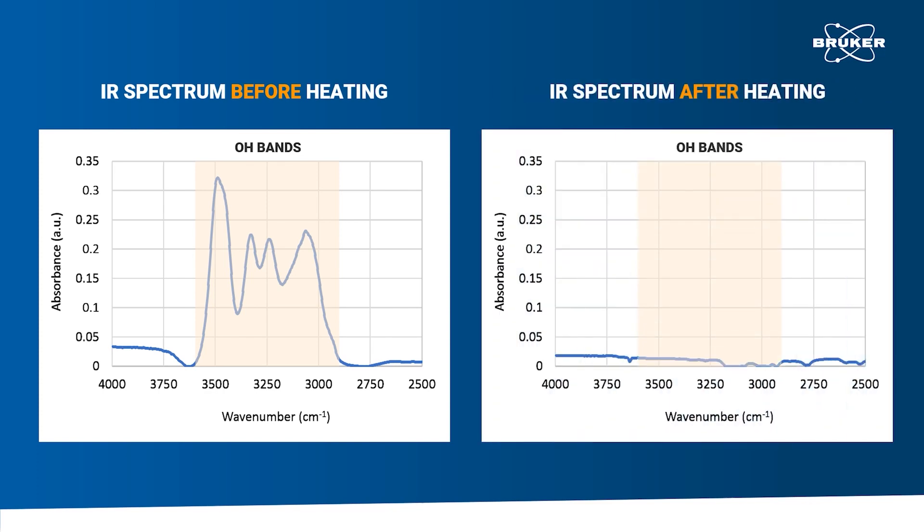So, our sample is losing its bound water. With our reaction monitoring software package, we cannot only compare the spectra before and after the reaction, but also follow the change of these or other relevant bands in situ and always know live how far the reaction has progressed.